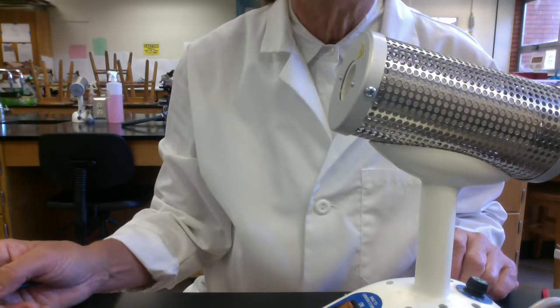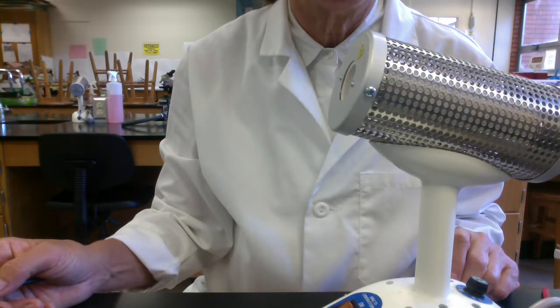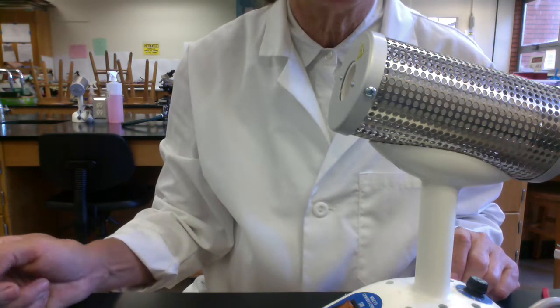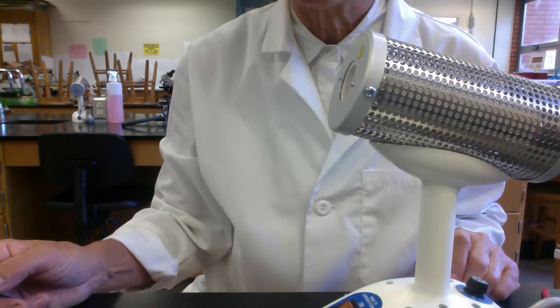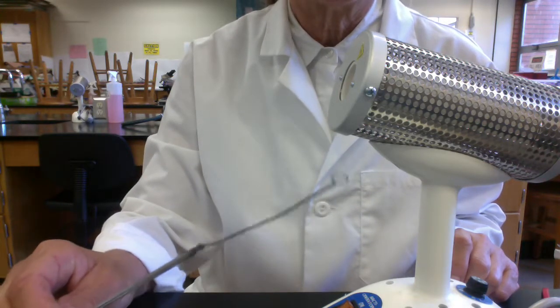When you are transferring microbes and you don't want them contaminated with unwanted environmental microbes, we often use transfer instruments. The one I like the best is called the inoculating loop. You can see it's just a wire that's been twisted into a loop.